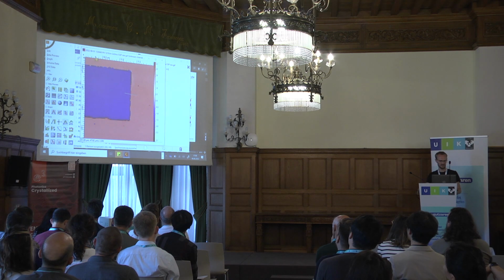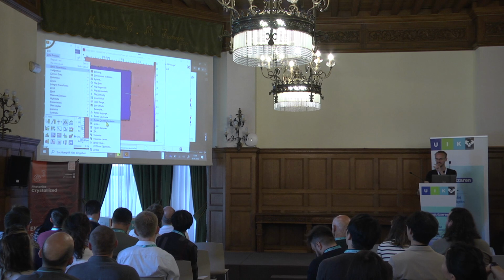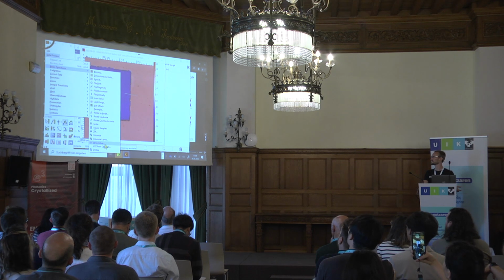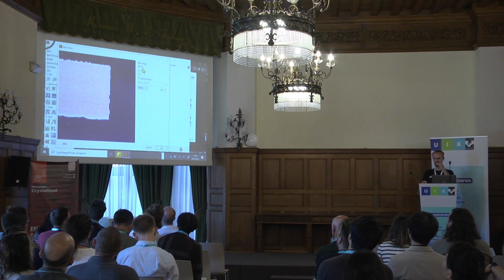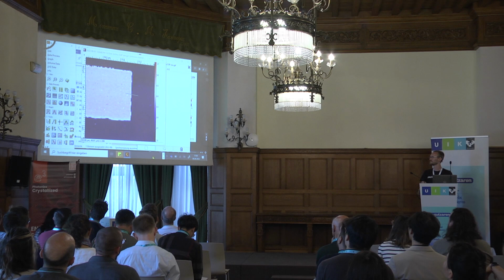You can correct this in Gwyddion, and this is for the people from the Uweske summer school, I found a better way to do it. Actually, somebody in the webinar found a better way, and I just copied it. It's this wrap value function. We click it. We say our phase is jumping in an interval of 2 pi. We hit OK, and we're done.